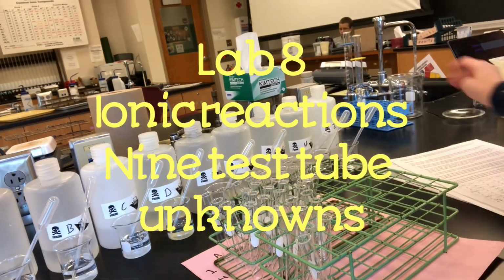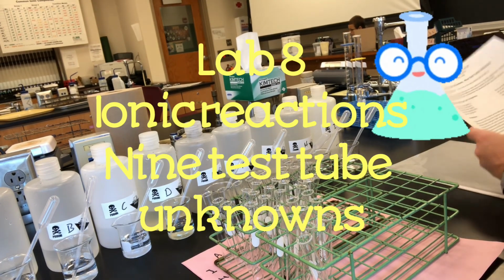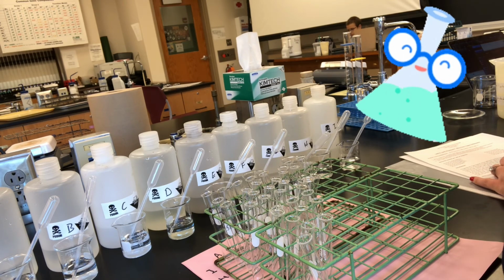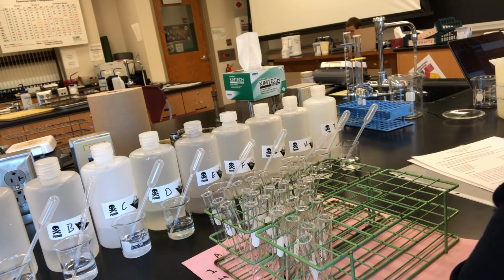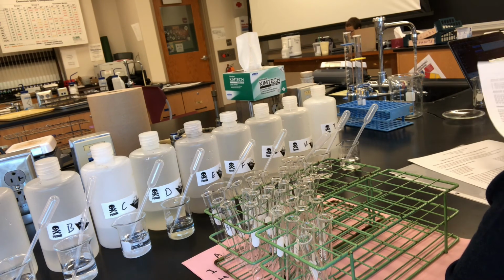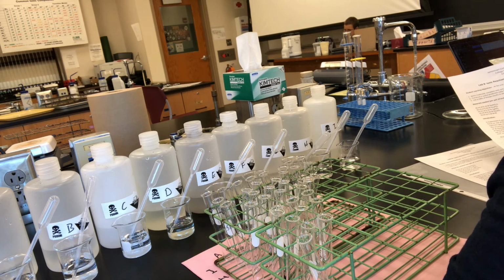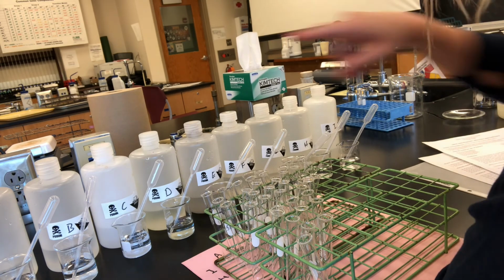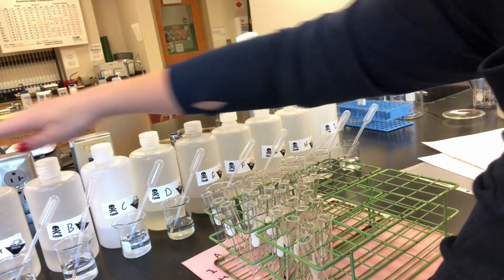All right, here we are with our video for experiment number 8, ionic reactions in 9 test tube unknowns. We have two possible sets of unknowns we could choose. We could either choose unknowns 1 through 9 or unknowns A through I. So I have the lettered unknowns, A through I, set out here.